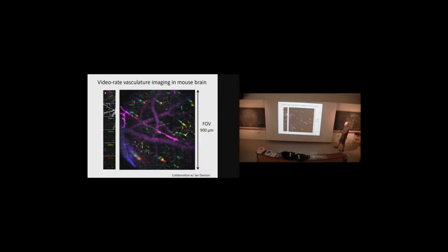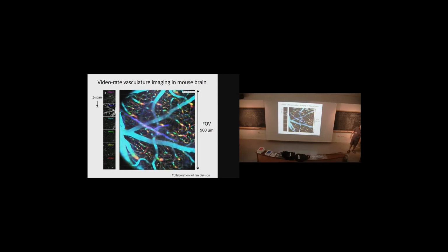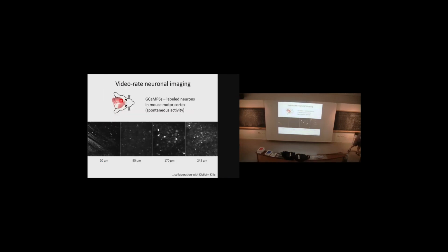But in any case, for example, this is 6-layer imaging. The problem is, well, we had laser. This is vasculature. So each color corresponds to a single depth. This is a single shot. And if you then do a scan, now all we have to do is scan from here to here, and we get the whole volume at the same time. So we're just scanning 100 microns, and you get a volume of 600 microns simultaneously. And you can get these kind of images, and so forth.